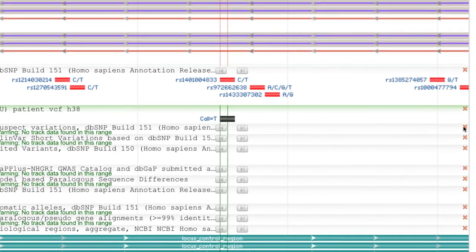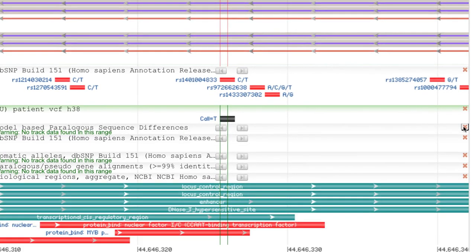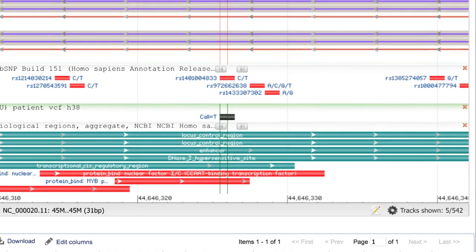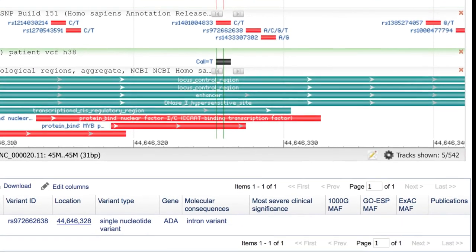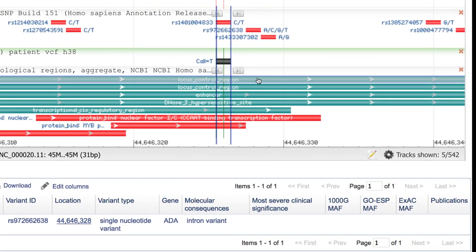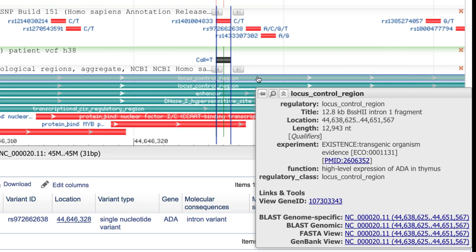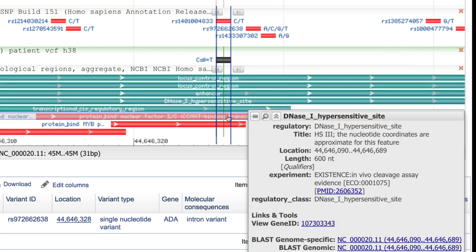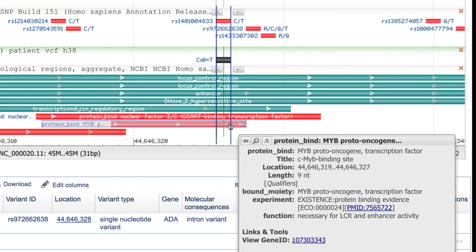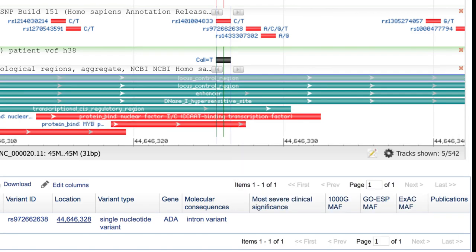And after a bit of cleanup, now we see some interesting features at this location, including a locus control region, and different transcription factor binding sites very close to our T allele. Certainly worth more investigation.